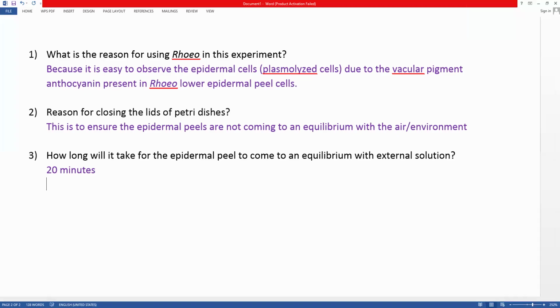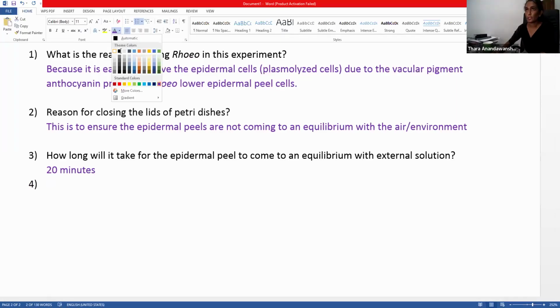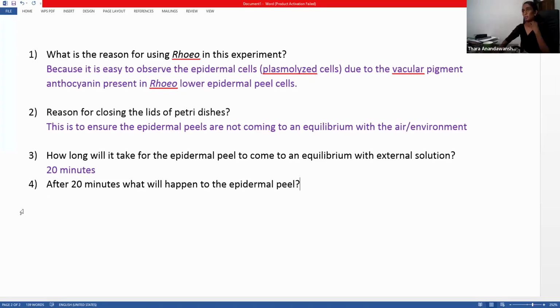Yes, miss. So my next question, after 20 minutes, what will happen to the epidermal peel? What do you think? After 20 minutes, what will happen?